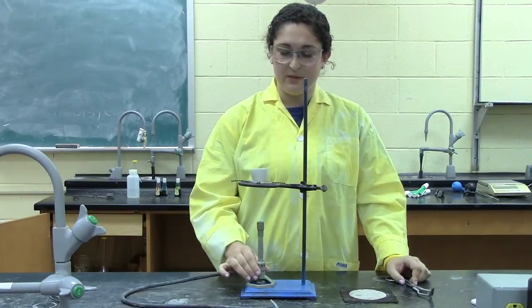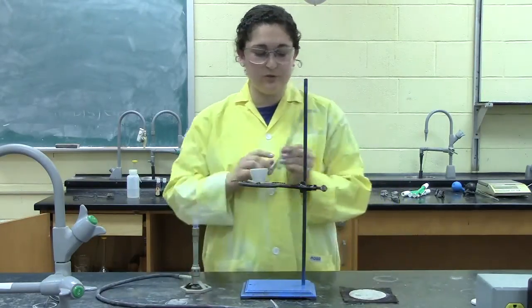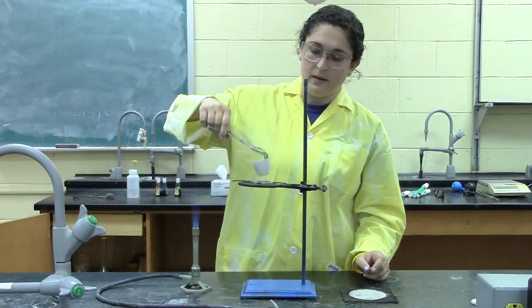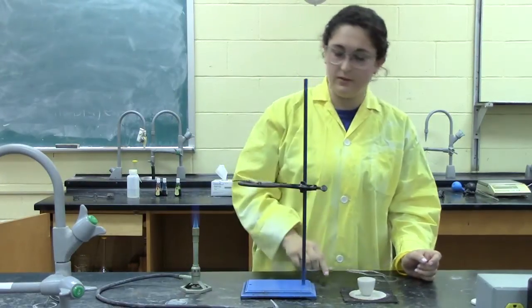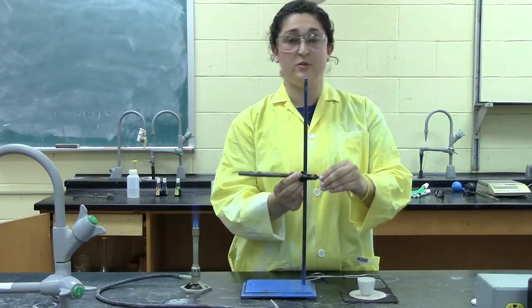Once you're done with that, you can remove your crucible with the tongs and then raise your ring so you don't burn your sample.